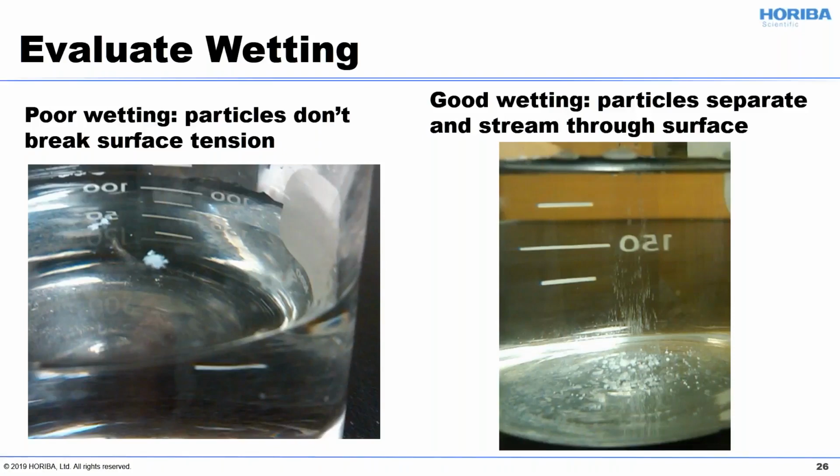the liquid. So one caution with this technique is if you put on a big clump of particles from a high height, gravity takes over and pulls it down through the surface tension. So you really want to kind of gently put it on there, so surface tension effects are important. And so you can look at these and say, well, if the alcohol worked, then maybe the sodium pyrophosphate showed good wetting. But let's try the sodium pyrophosphate because it's easier to handle than lots of alcohol.